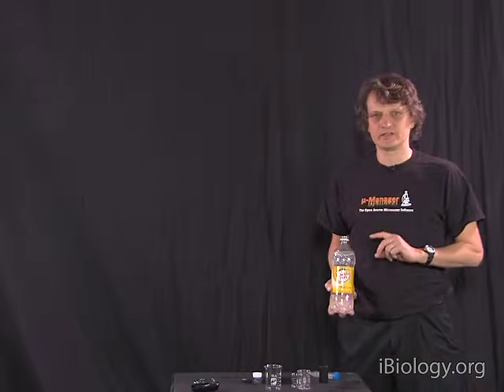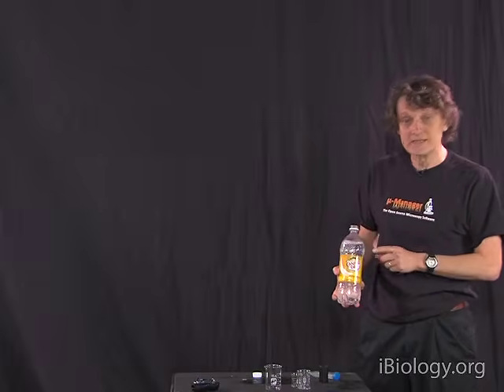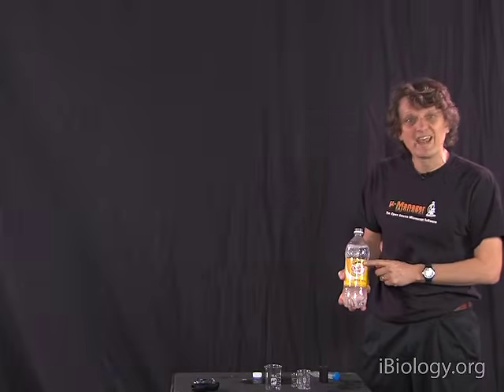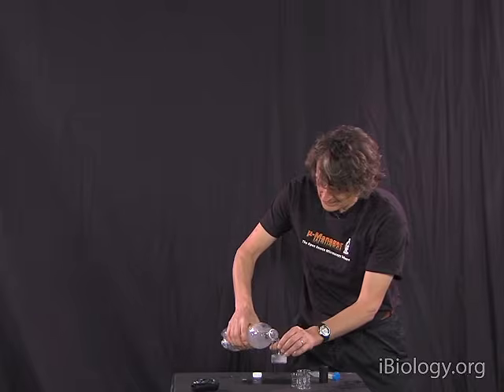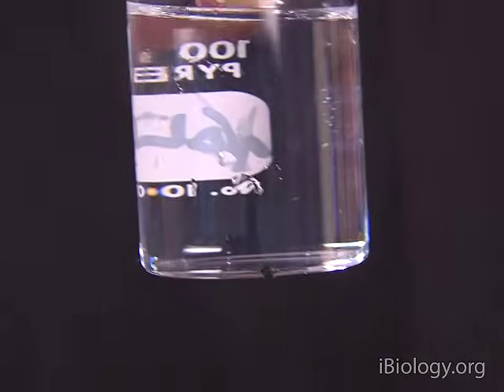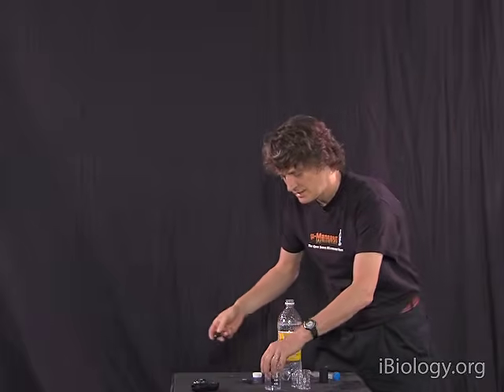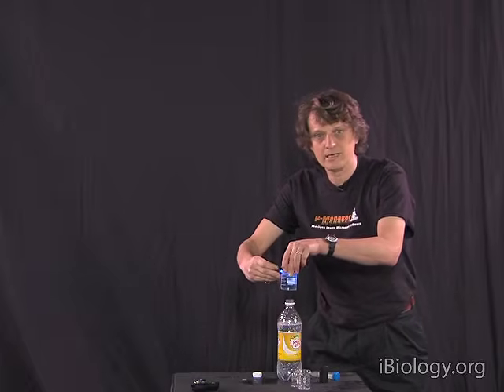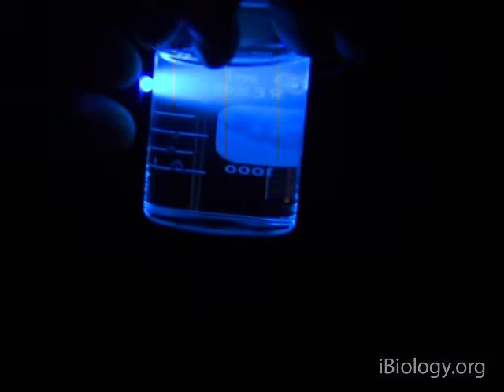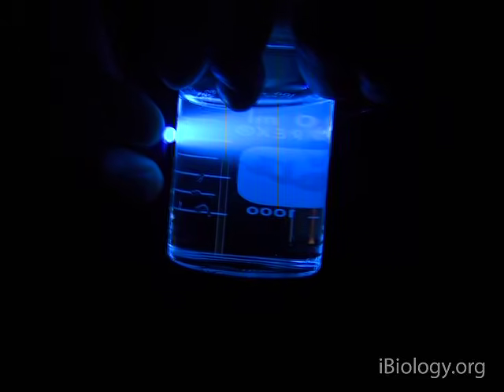And I will now try to repeat that 150-year-old experiment here in the lab and show you that now. The bark of the cinchona tree is hard to come by, but luckily the active ingredient, quinine, can be found in every supermarket, contained in tonic water. So I'll take this tonic water and pour it in a glass. The other part is that we need UV light to illuminate it, and that you can buy in the form of what's called a urine tracker in the pet store. And when we now shine this UV light into the tonic water, you see that you get a blue light emanating from within that tonic water.